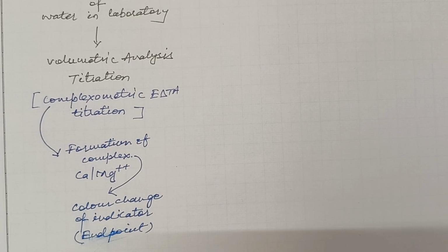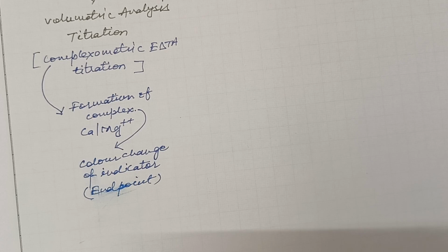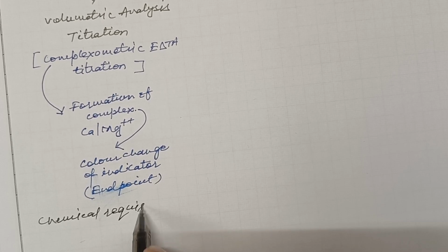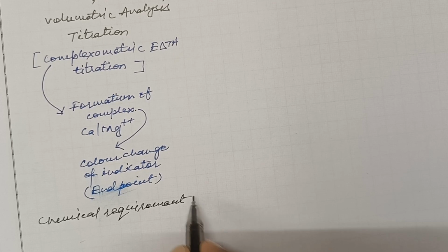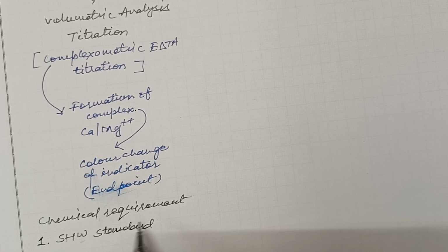Now we would like to discuss the chemical requirements for the practical. So we need certain chemical solutions. For example, number one, SHW. SHW means standard hard water.